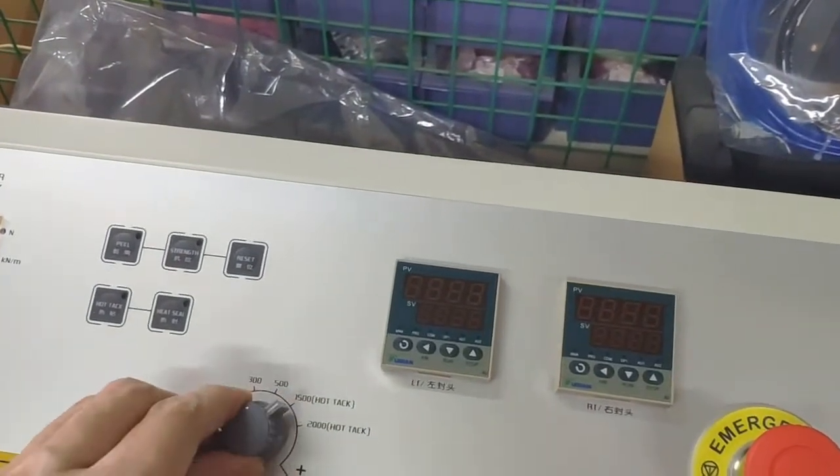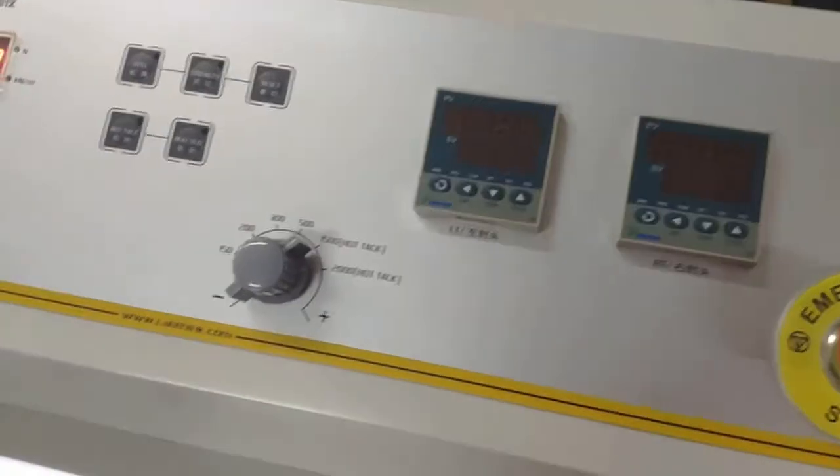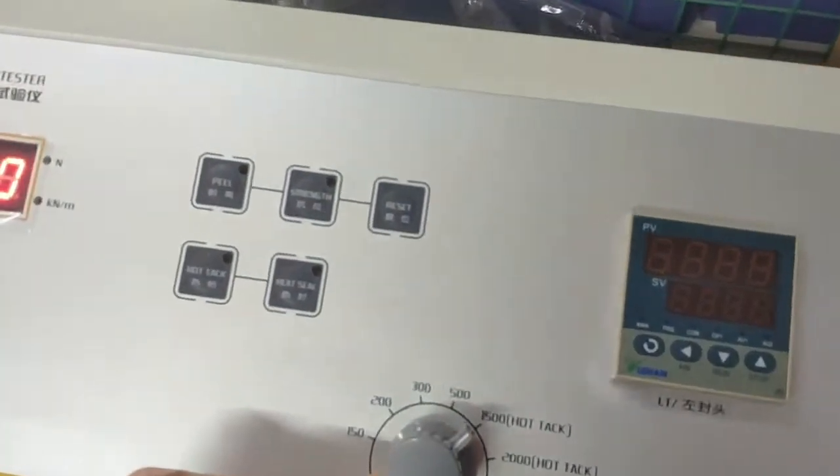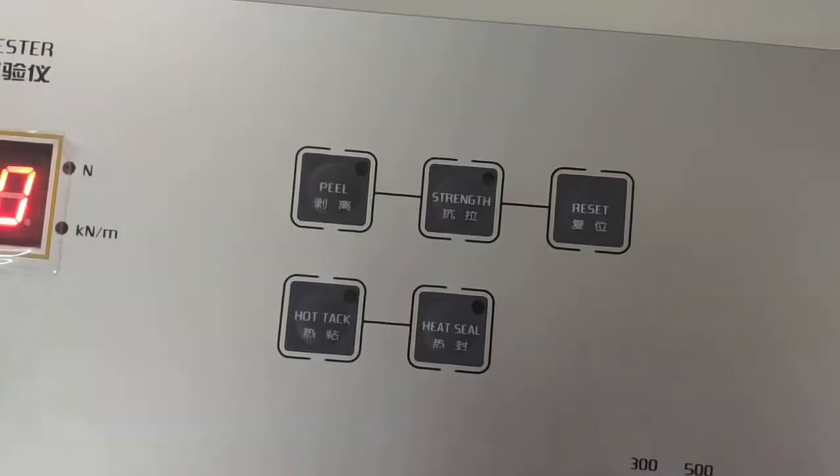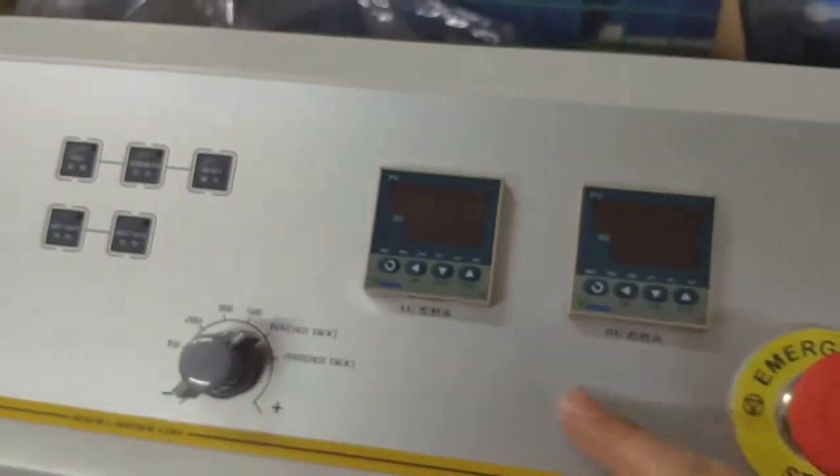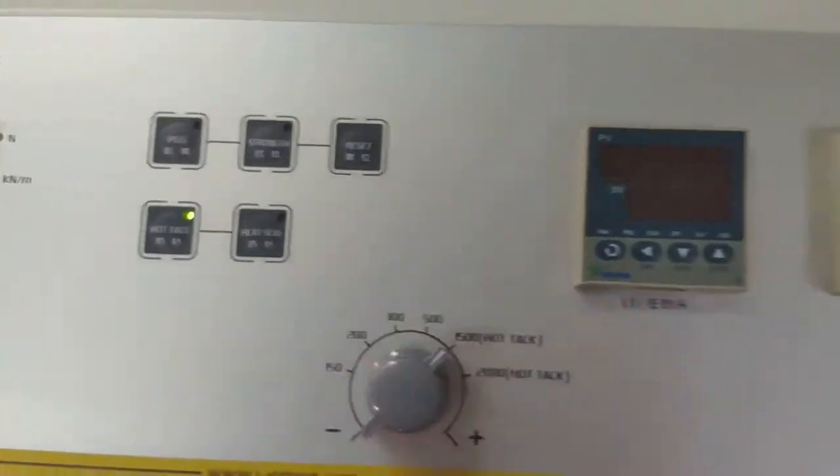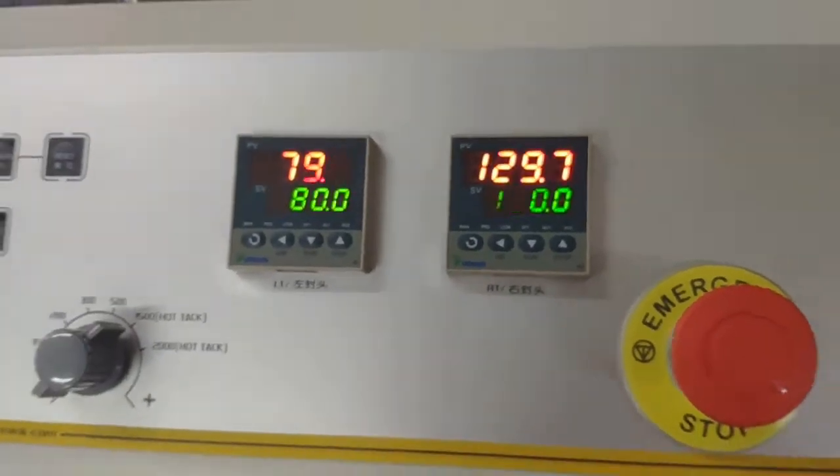If you want to do hot tack, make sure the mode is on hot tack. You have to select hot tack or heat seal to activate these temperature controllers. Press the hot tack button, then the temperature controllers start working.